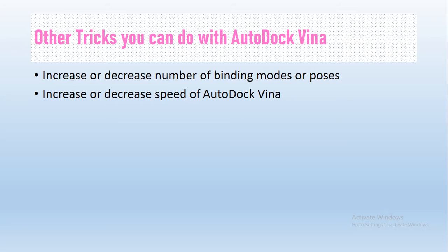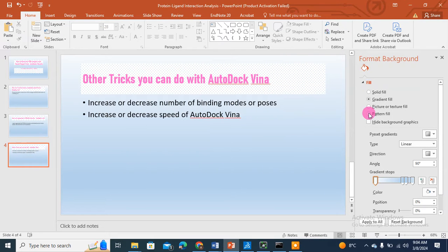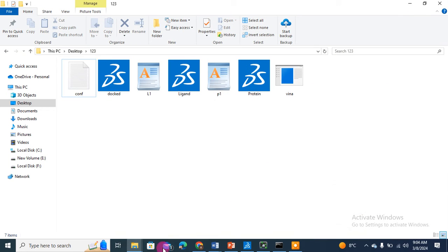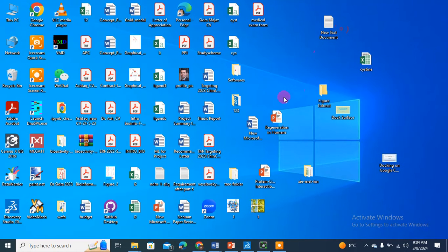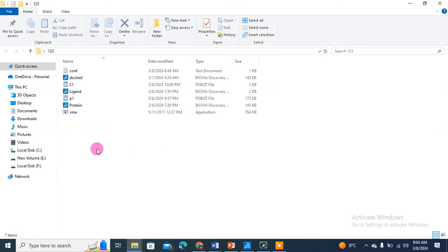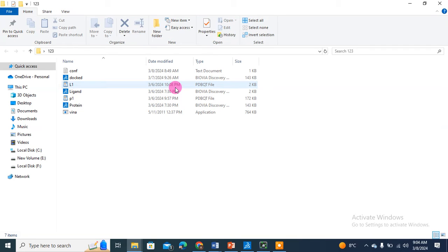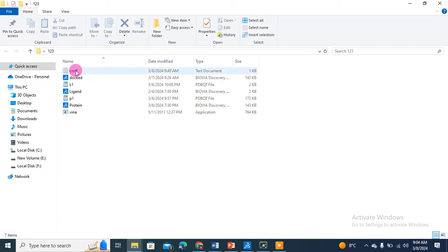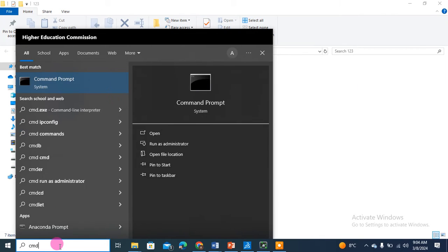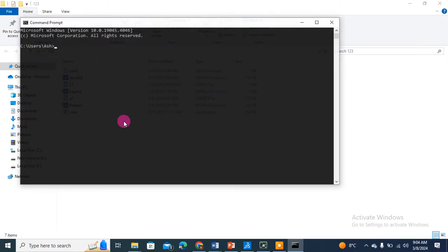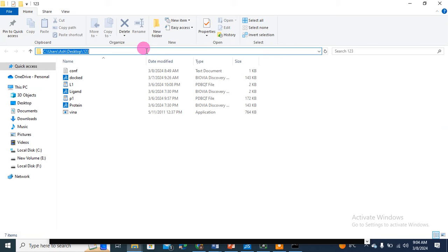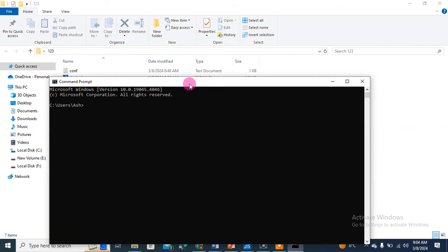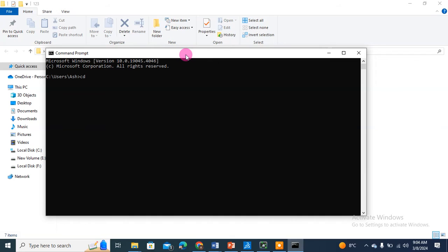Our files are present here in this directory. This is our ligand PDBQT file we prepared in our last video. This is our protein file in PDBQT format. This is Vina and this is the configuration file. I'm going to run it quickly with certain modifications. I will copy the path as I discussed in my last video.